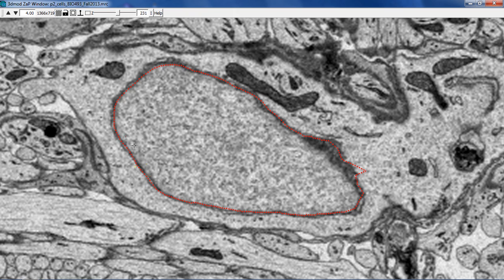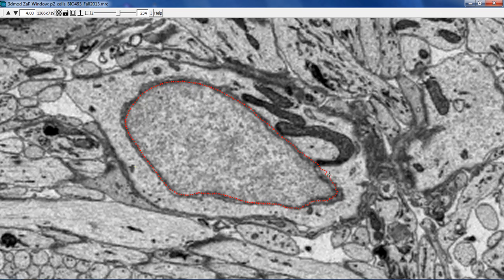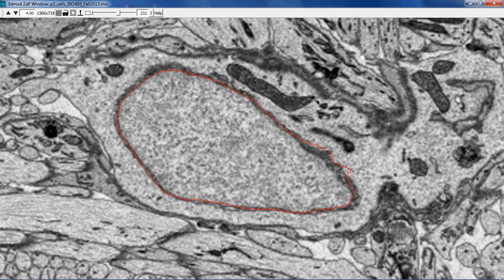You'll see in spots like this, where there's very little change, that it's pretty accurate. But in spots, for example, where there's a protrusion later, it's a little less accurate. So we'll go here, we'll hit 2 for our sculpt tool. Reduce down that piece that's jutting out.